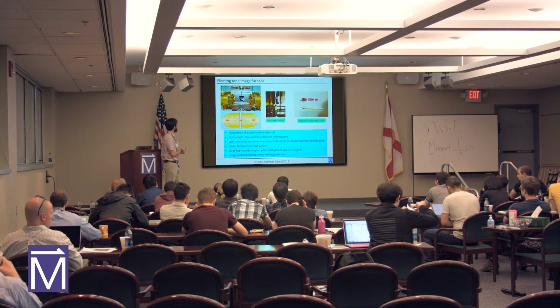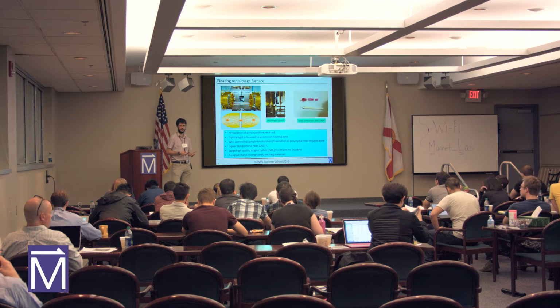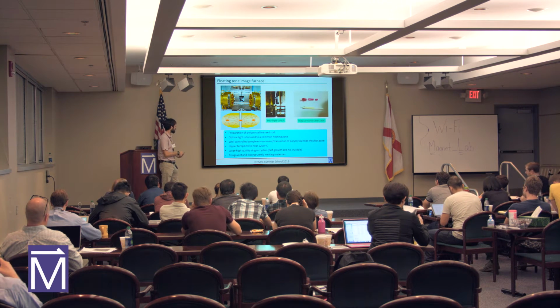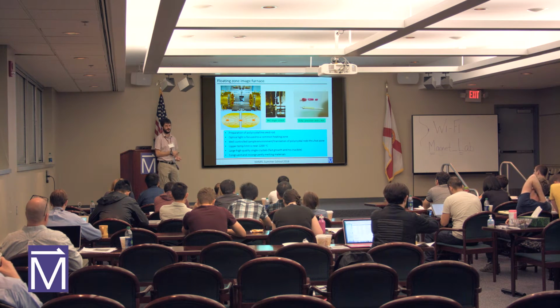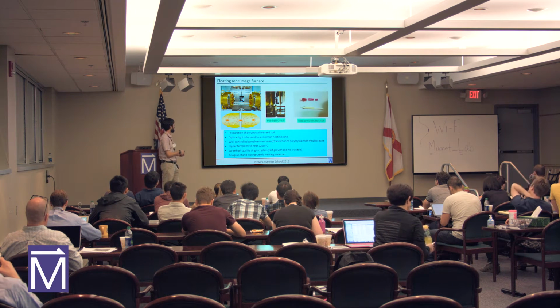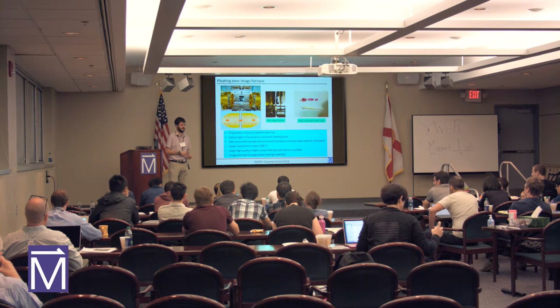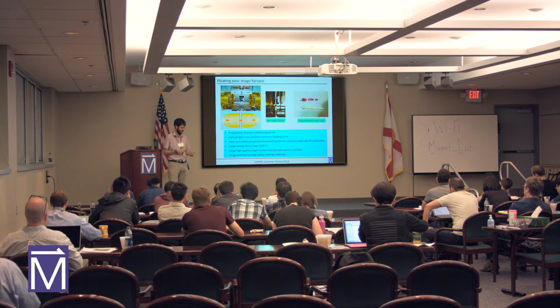All of this is done inside of a quartz tube enclosure where you can flow specialty gases or whatever you like. And so it's really pretty powerful. I mentioned that this is mainly used for growth of oxides because controlling this environment is a little bit challenging. So if you wanted to grow intermetallics in there, in order to avoid oxidizing them at high temperatures, you'd have to make a pretty nice gas flow circuit. We've tried to do that here with our systems, and it's been a real challenge. So I wouldn't advise trying to grow intermetallics in a system like this.